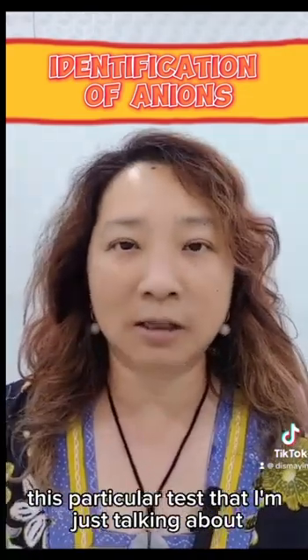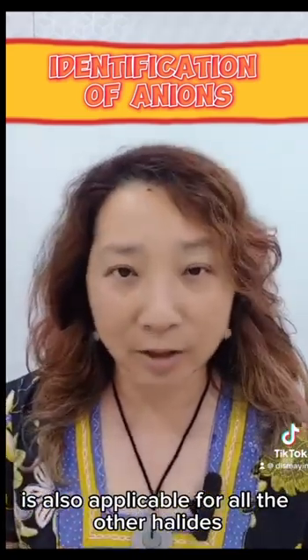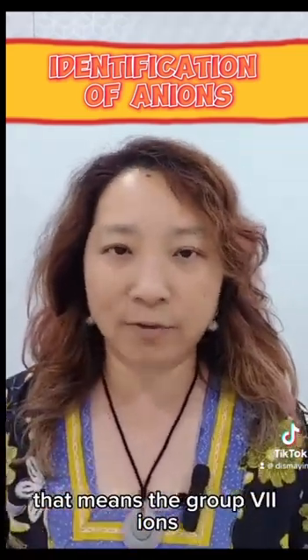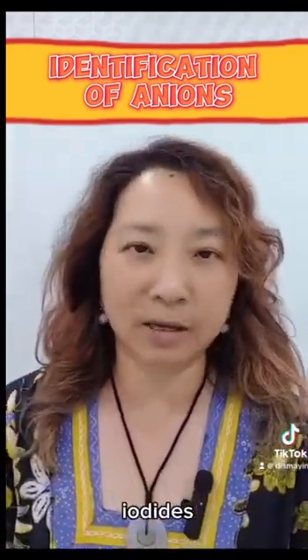This particular test is also applicable for all the other halides. That means the group 7 ions, for example fluorides, bromides, iodides, etc.